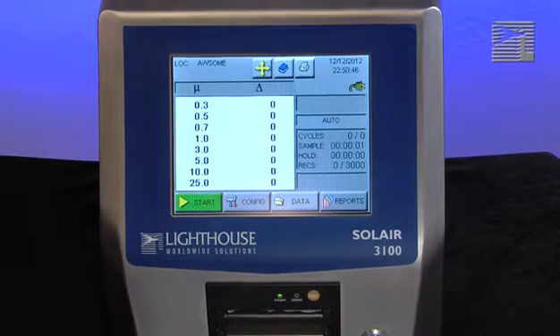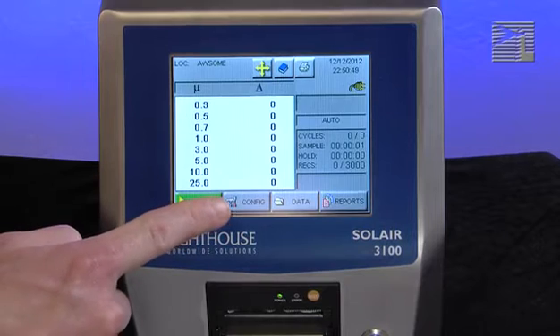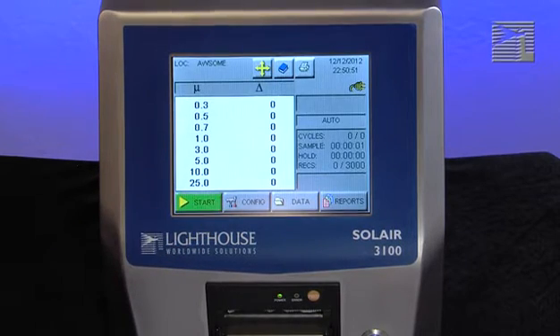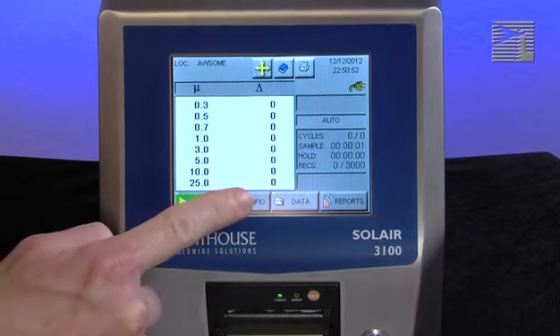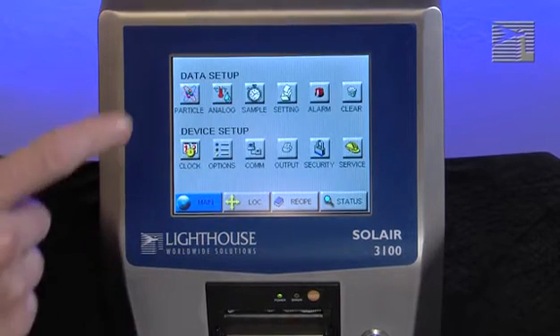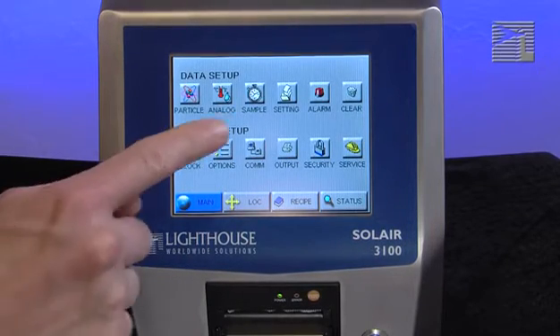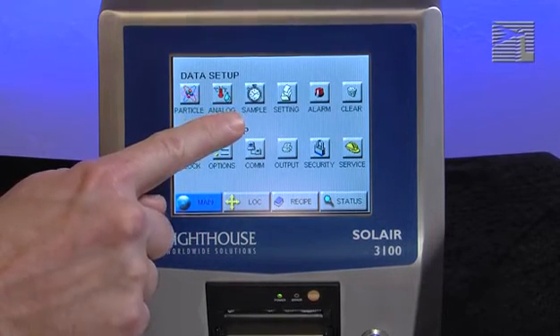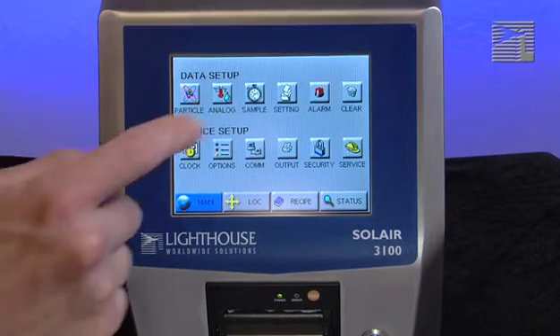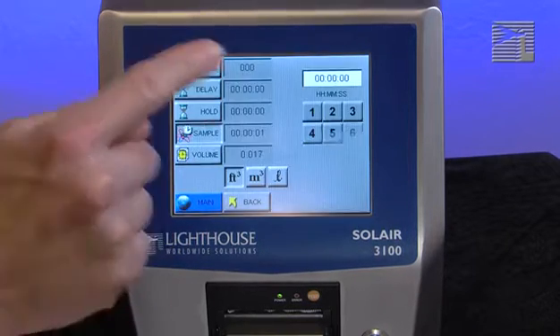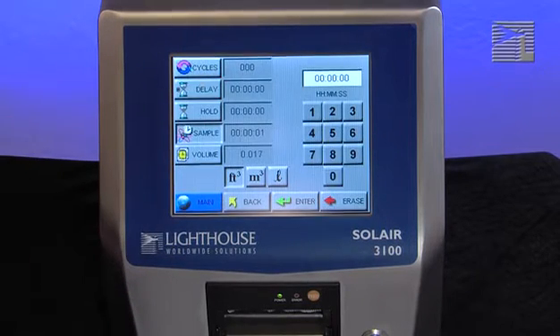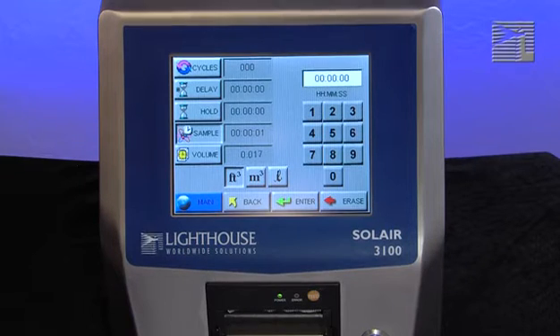From the main screen, press the configuration button on the bottom portion of the screen. When pressed, you will enter into the main configuration screen. Next, press the sample button, which is the button that has a picture of a stopwatch on it. On the sample page you will see the following sample settings.